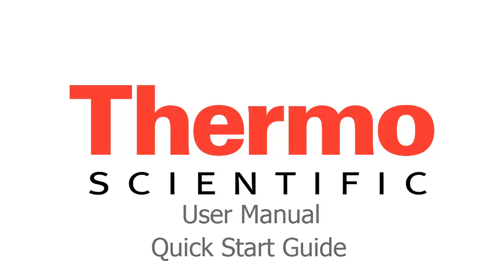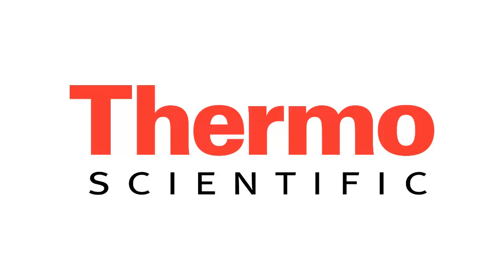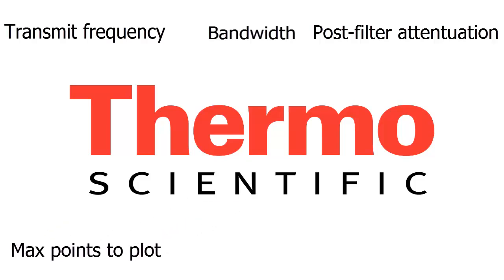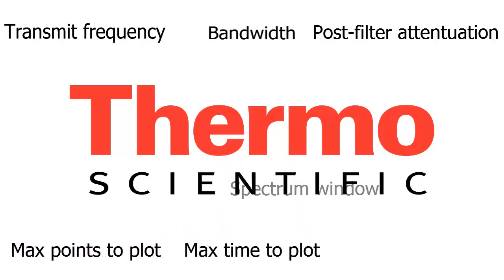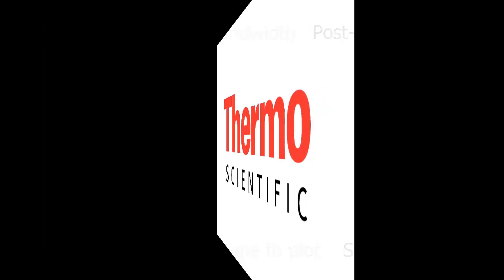These documents are located under the documentation section of the support page of our website at www.picoSpin.com. Both HTML and PDF versions of the documentation are available. We will cover topics such as how to adjust the transmit frequency, the bandwidth and post-filter attenuation, the maximum number of points to plot, the maximum time to plot, and also how to size the spectrum window.